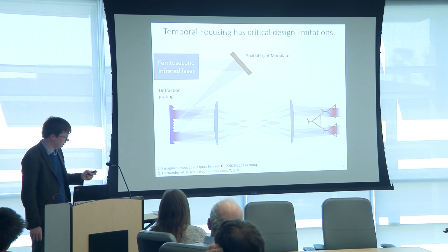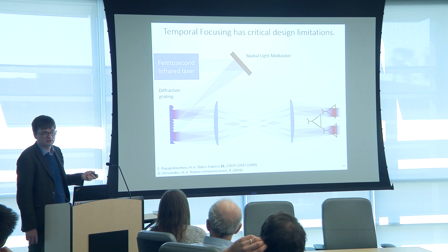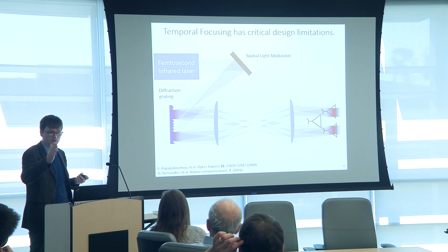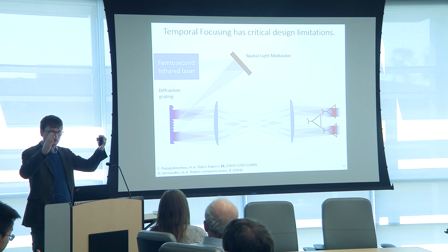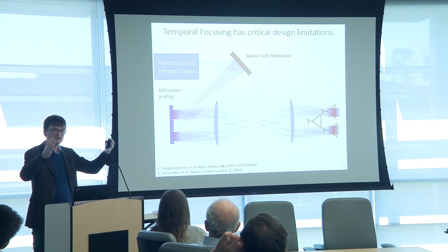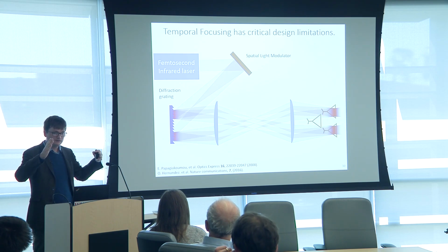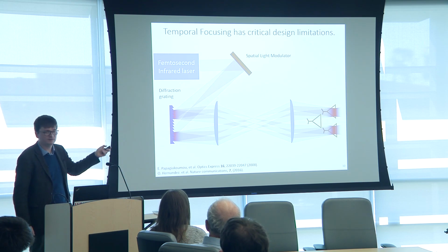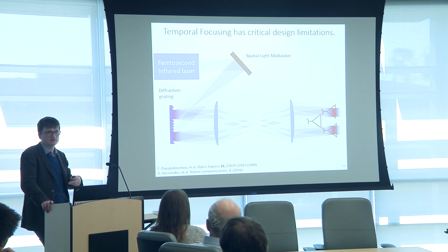Yes, so this is actually one of the techniques that have been developed concurrently with 3D-SHOT, where they use 2 SLMs with the diffraction grating in between the two. In the first modality that was implemented, one SLM would split the holograms into multiple sub-holograms and apply a defocusing lens to virtually move a portion of the diffraction grating to the proper depth. And then on those virtual diffraction gratings, display a custom pattern.